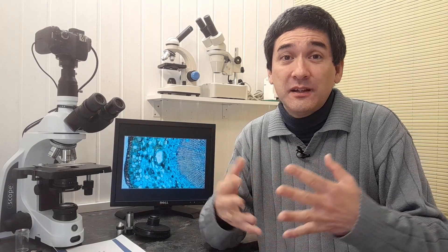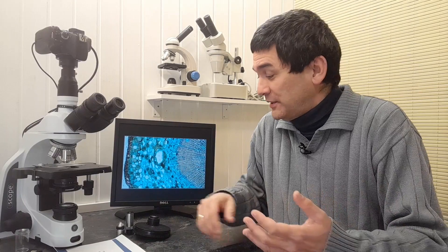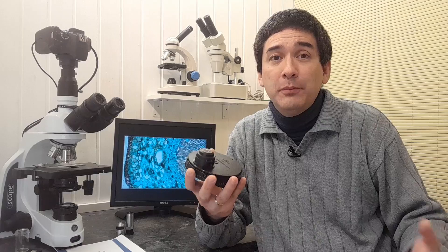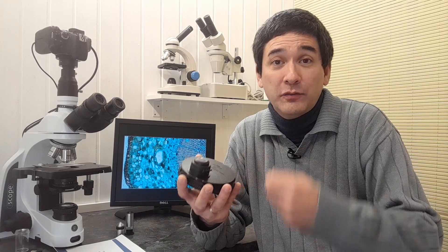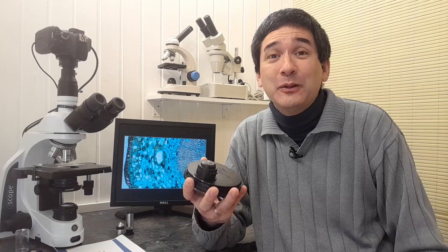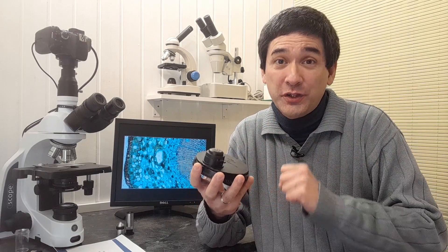And the question now is if you already have a condenser, the phase contrast condenser like I have over here, are you then able to use any type of objectives for the microscope like the ones that you already have? And the short answer is no.